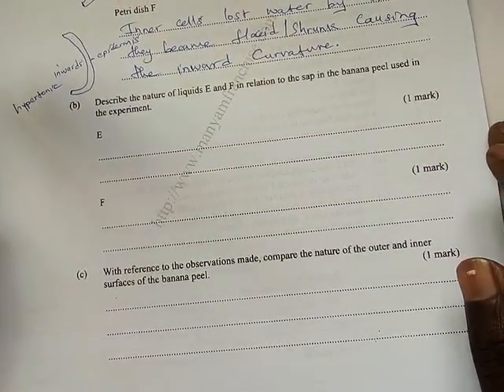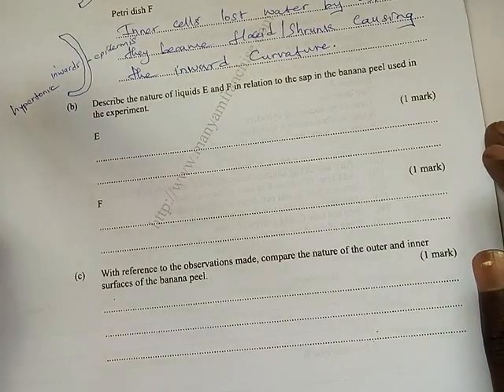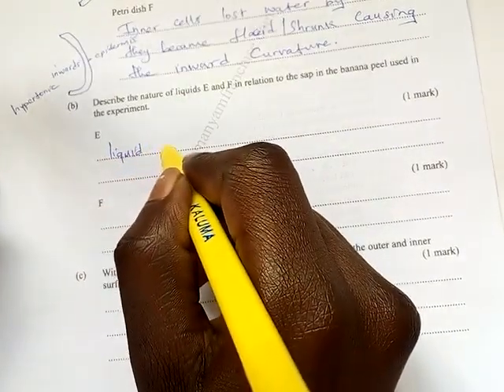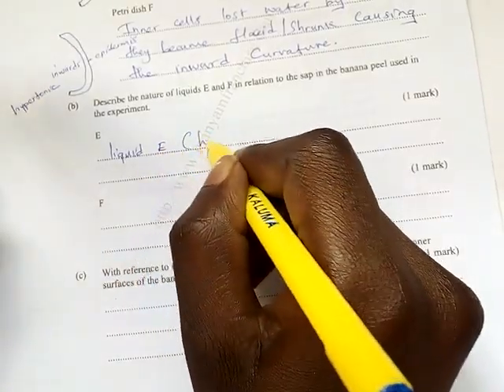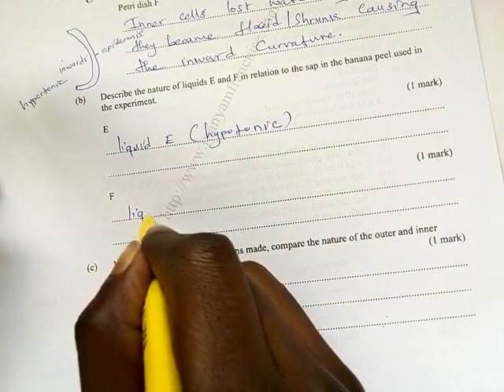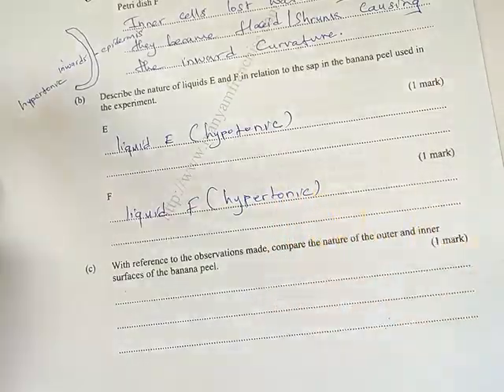Now in B, describe the nature of liquids E and F in relation to the sap in the banana peel used in this experiment. Now liquid E is hypotonic, while liquid F is hypertonic.